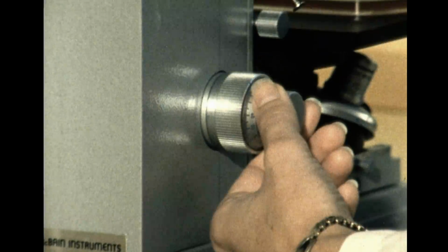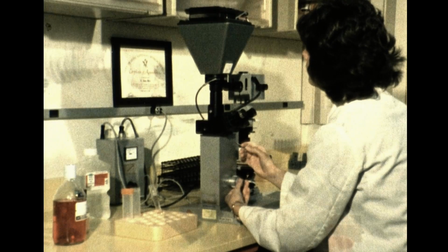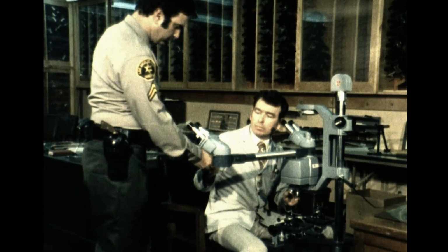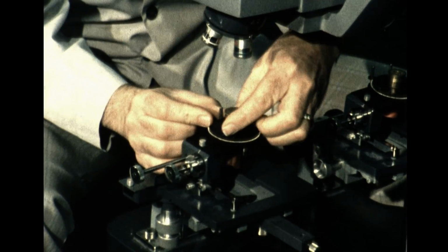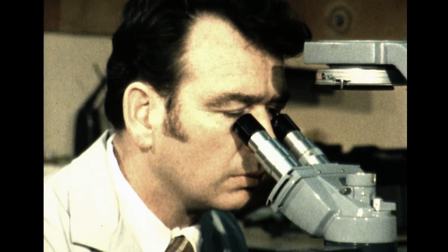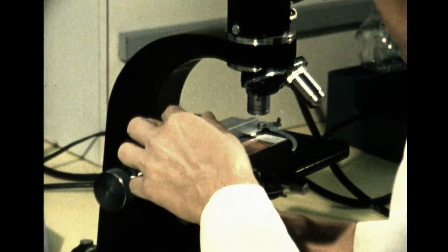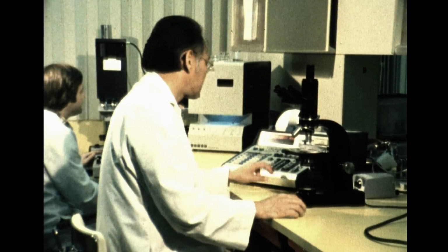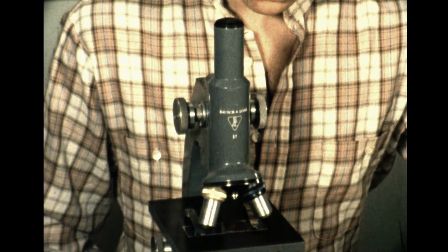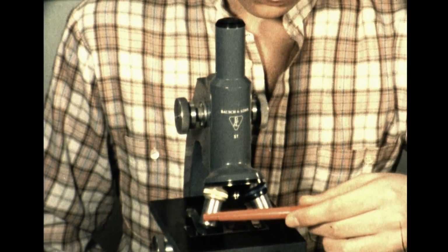The optical microscope is used in many fields, in the doctor's office, in industry, by the police in the investigation of crime, by scientists in many areas, especially in biology. The compound microscope is probably the most commonly used instrument. It enables the operator to achieve a low and high degree of magnification.